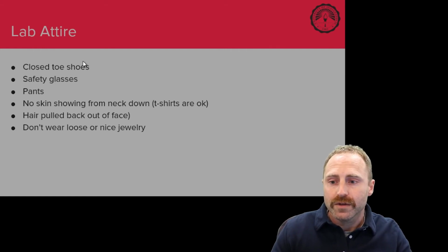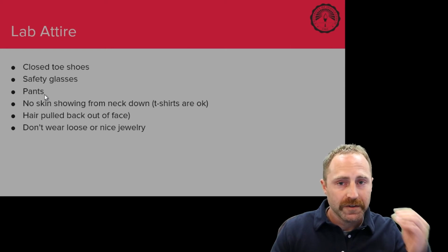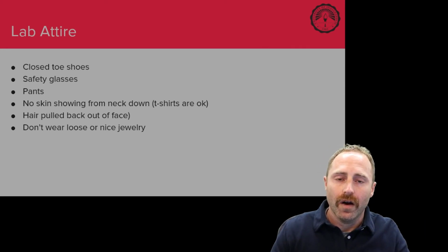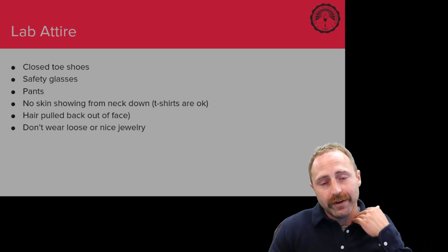So closed-toed shoes. You have to have your safety glasses. You are responsible for bringing your safety glasses every time that you come to lab. Wear pants. Dresses and skirts and that kind of thing aren't going to work. And that goes directly into the next bullet point. You can really just say don't have any skin showing from your neck down.